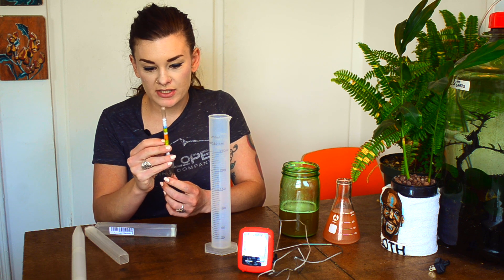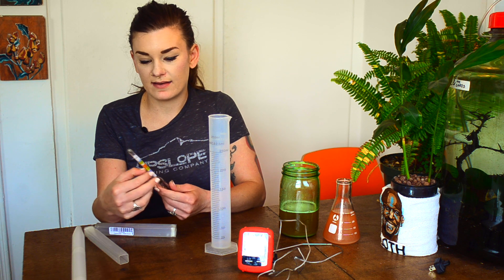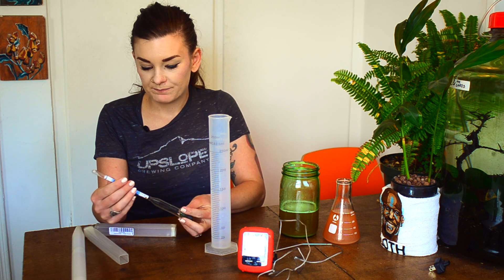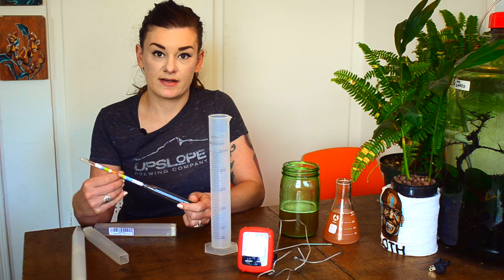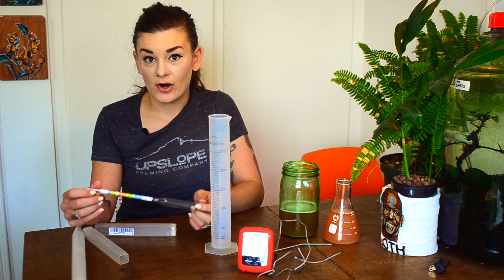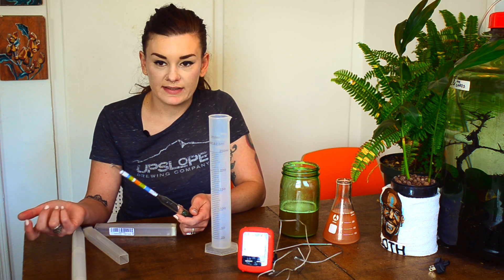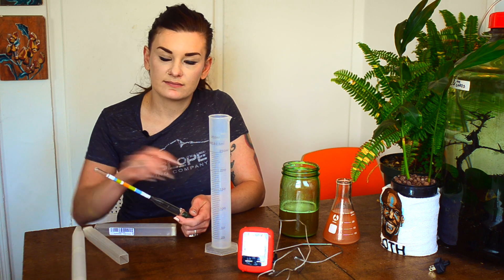This hydrometer actually has wine, beer, table wine, and dessert wine as metrics on it. There's also a Brix scale on here, and a Brix scale is actually more accurate for our purposes with beer, especially when it comes to relating to refractometers — but that's later in the video.